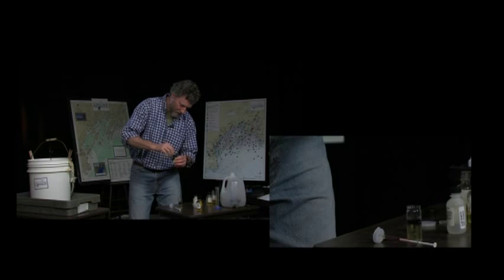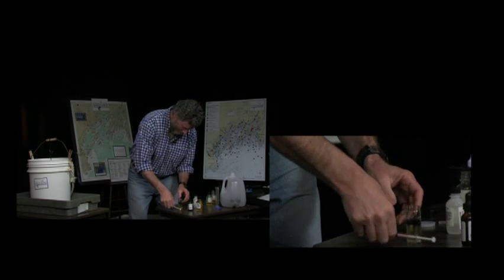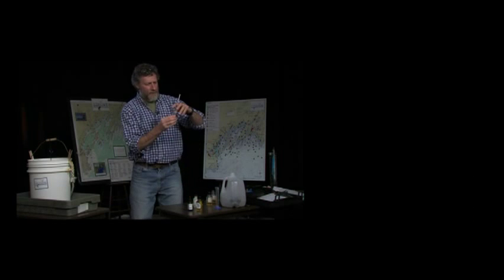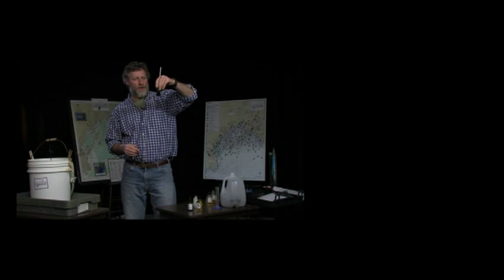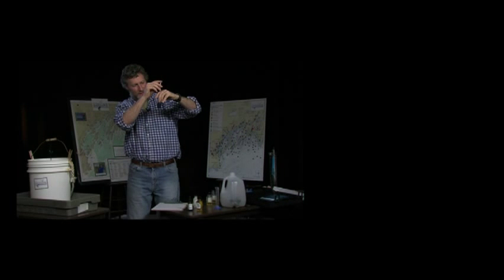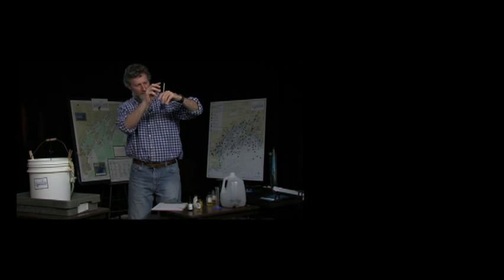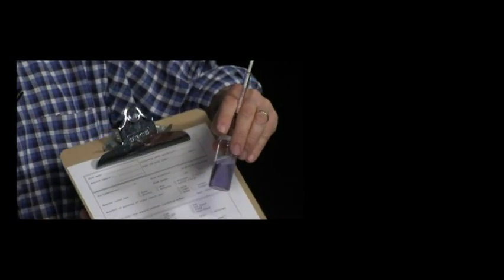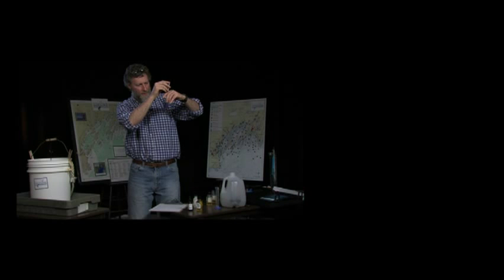And we'll add 8 drops. And again, we're going to mix that really well. And eventually this is going to go clear. We're going to get really close. Again, I can check with a white background and look. It's not quite there. It might require a drop.